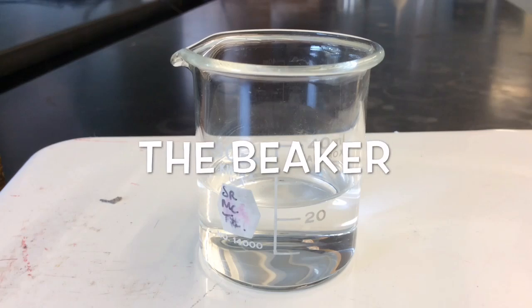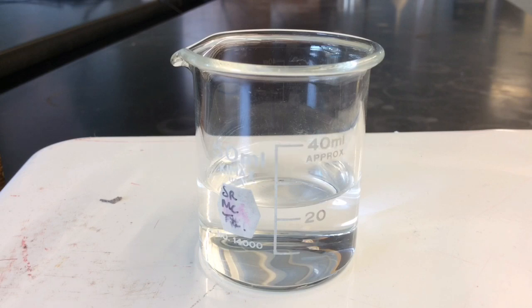This video will discuss the precision of various pieces of glassware. The first piece of glassware we're looking at is a beaker. It is a very inexpensive piece of glassware, and it's inexpensive because it is neither accurate nor precise.